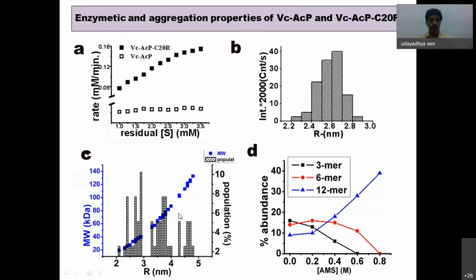So we show this is dodecamer. The size is so big, what is happening over there? So we wanted to crystallize it. But how to achieve this with only the dodecamer? So we did some experiment. We added different kinds of salt to the protein and did DLS. Then we see that if we add any tetrahedral anionic molecule to the protein, we see this.